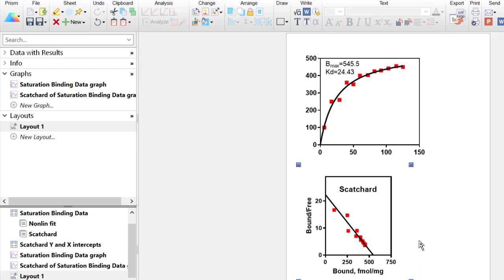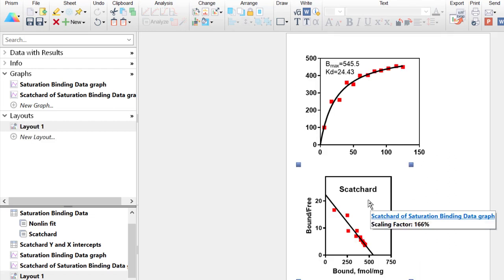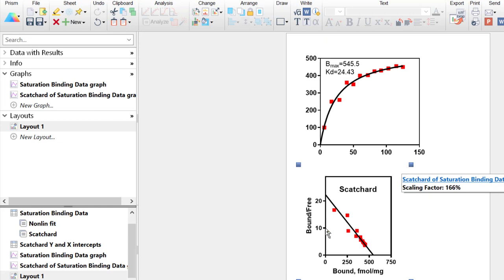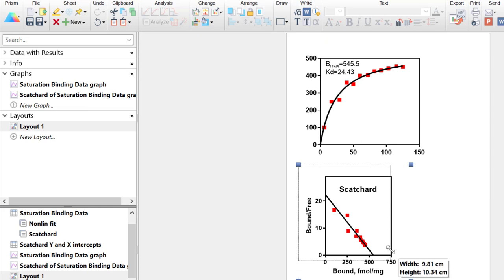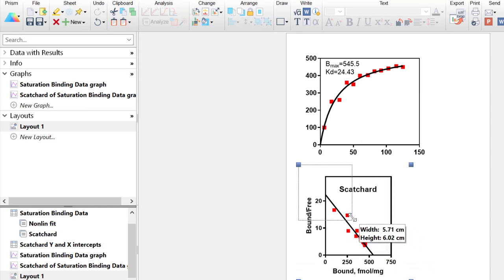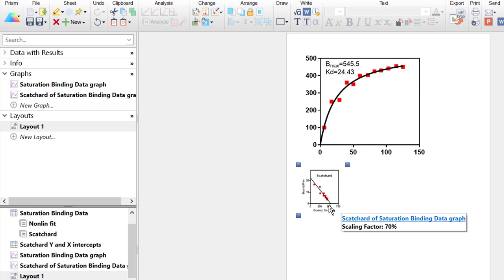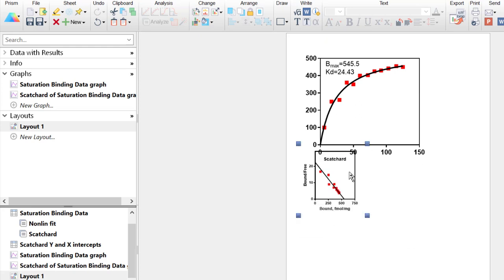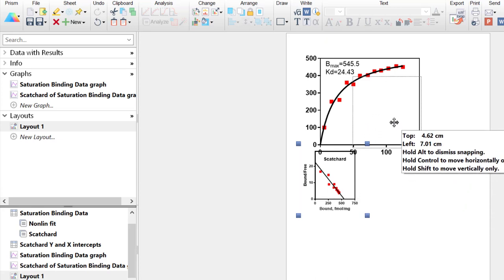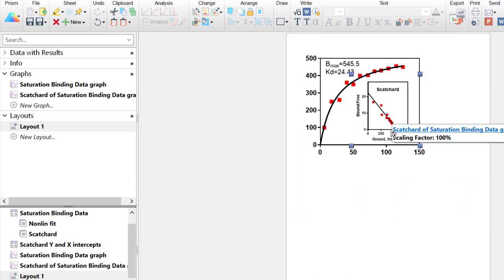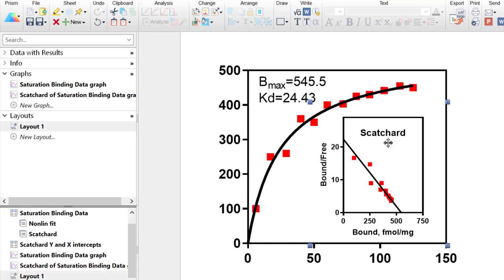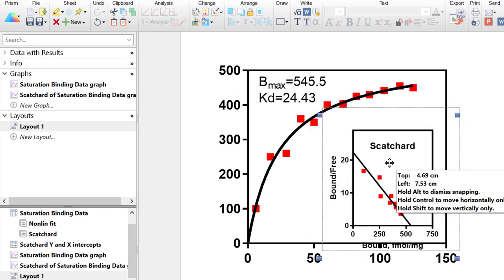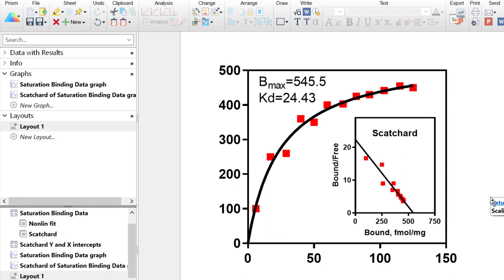Now we have both graphs on the layout page. With the bottom graph selected, four blue squares appear in each corner which I can click and drag to change the size. I'll make the scatterplot a bit smaller and then click and drag it into the empty space of the first graph. Now the two graphs are combined and overlaid to look like a single graph.